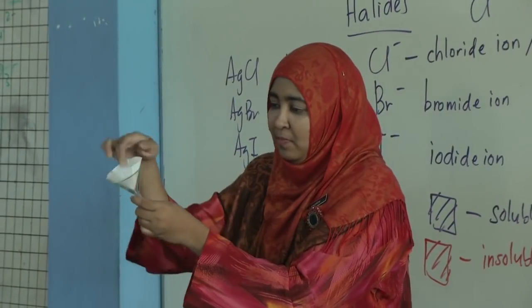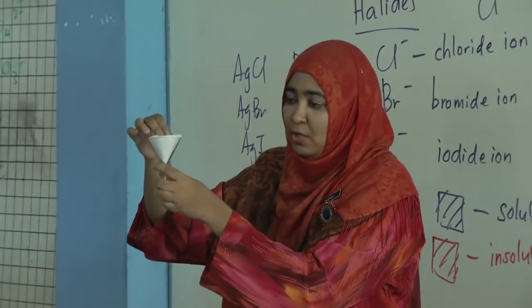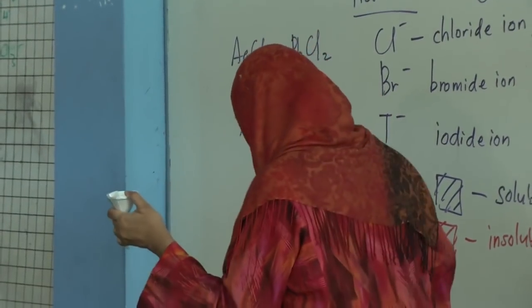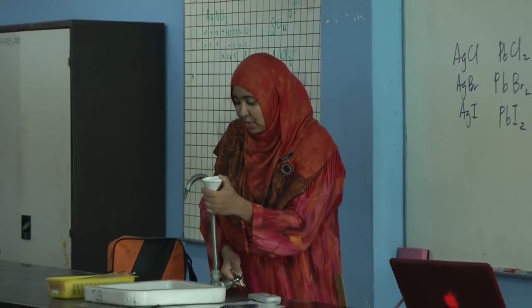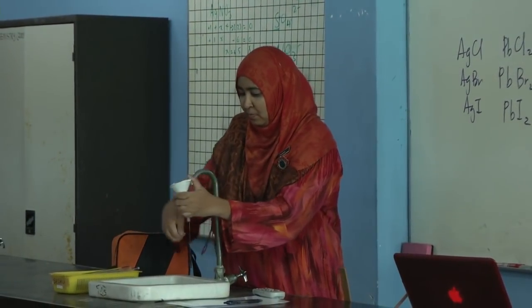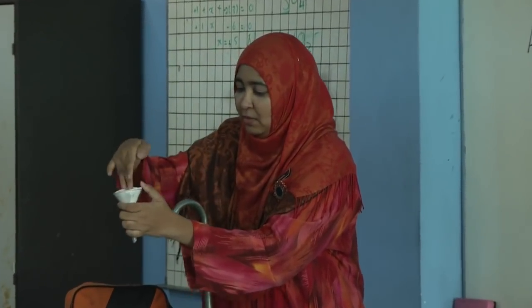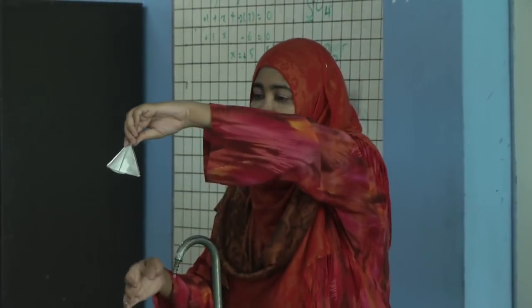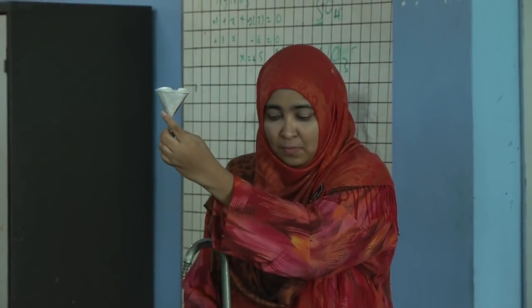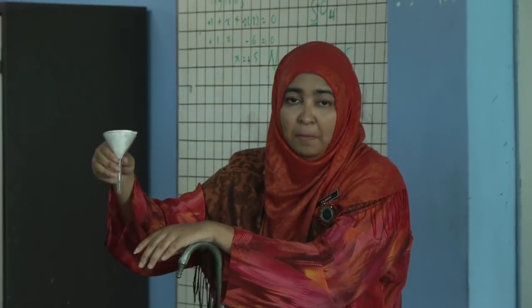But as you can see, the filter paper does not sit properly inside the filter funnel. So what I have to do is just sprinkle some water. Alright, like that. Okay, wet it. So use your fingers to wet it. And now it is sticking. Okay? Clear? Yes.